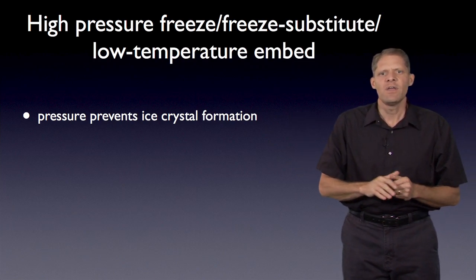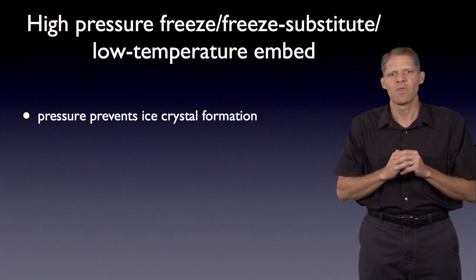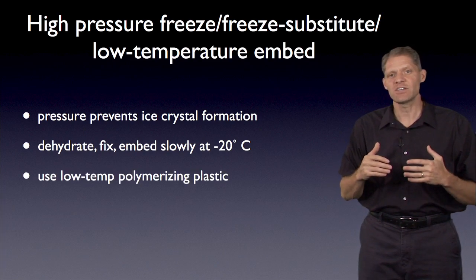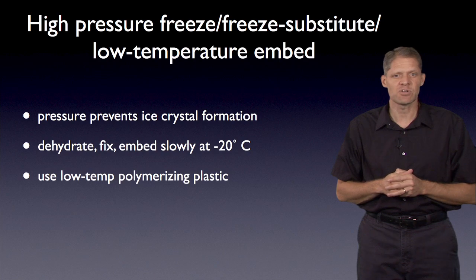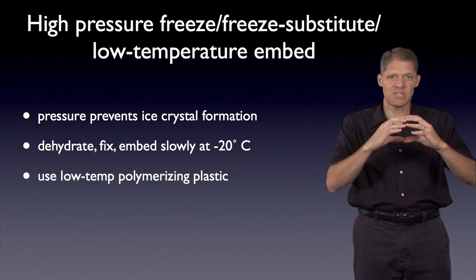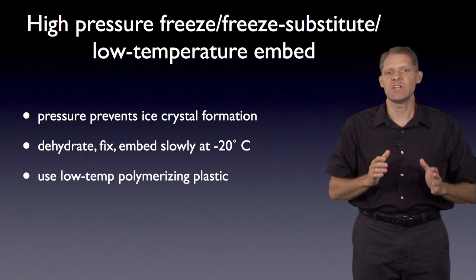In the next step, the freeze substitution, while the block of tissue is still held below freezing temperature, it can be dehydrated and infiltrated with an organic solvent, and finally with a plastic resin that will polymerize even at below freezing temperatures. And this is what's called low temperature embedding. And so starting with a high pressure frozen block of material, it can be plastic embedded all before it really thaws completely. And this preserves the native structure of the cells.